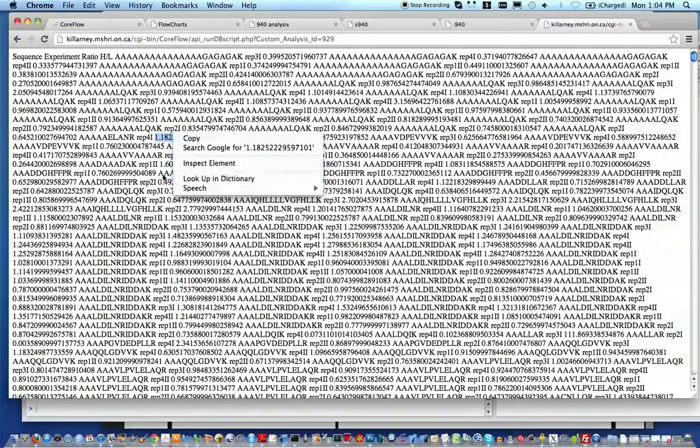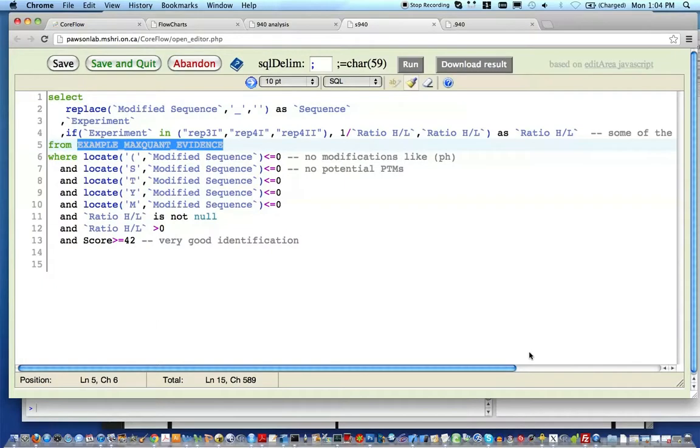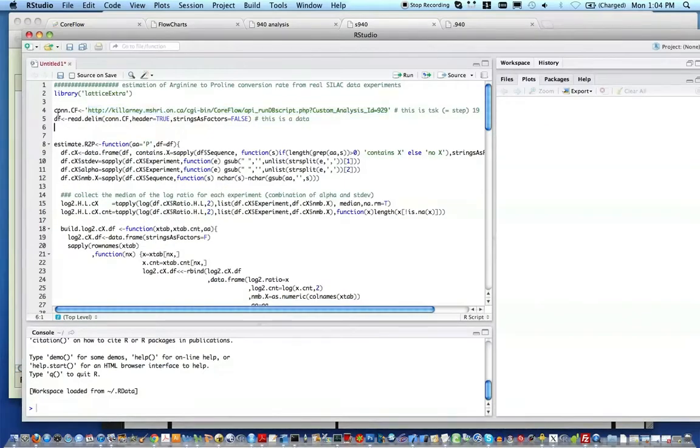This is mostly, as you can see, a text document that is very long. It has all the rows. There is a separation of the rows, but you cannot see it. Anyhow, a language like R can understand this very easily and can read it.